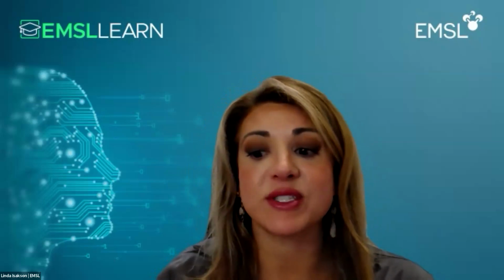How is XPS different than XAS? They seem like similar techniques. I'm interested in XPS to differentiate types of mineral phosphates like calcium phosphates, iron phosphates, aluminum. Would XPS be able to do this?